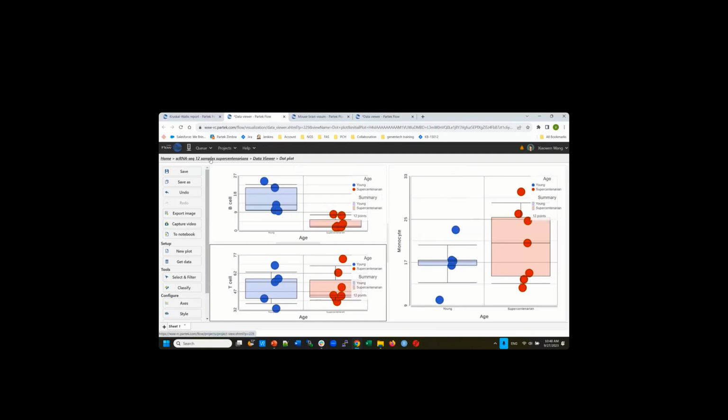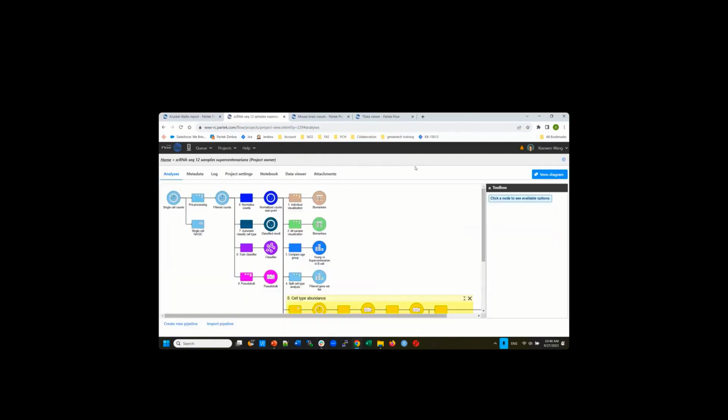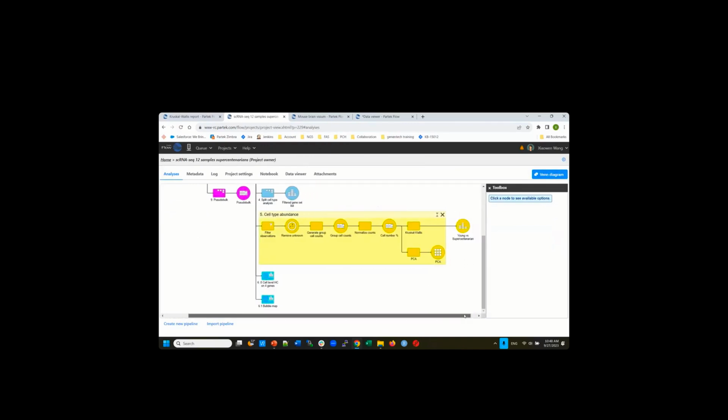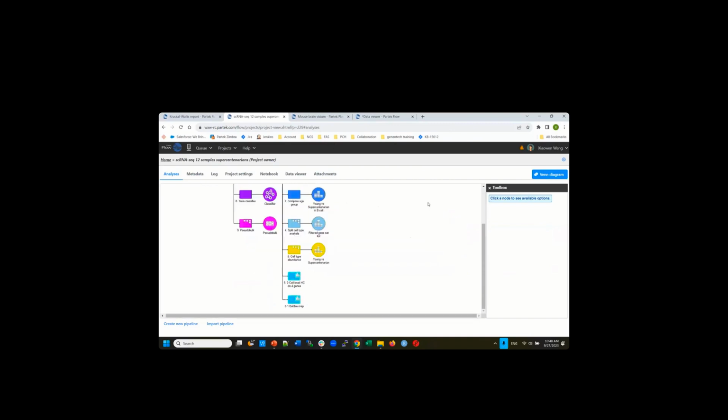That's called the cell type abundance analysis. We have multiple samples, so we can answer this type of question. Another thing is, once you identify your cell type, at the very end, if you want to present, okay, I do have this marker gene, so they can really differentiate all the cell types. So you discovered your marker genes, and you want to present that those genes can really differentiate different groups, etc.